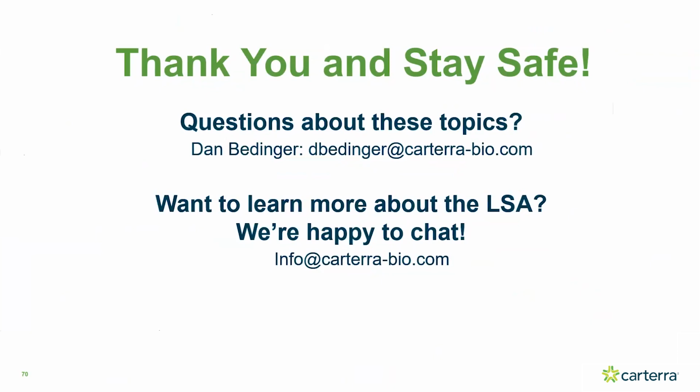And the other part of the question was, how do you ensure that you're capturing at the right density? So there's a few strategies. The best and the easiest is to immobilize at multiple densities. Then you can pick and choose. You would use probably the lowest density spot you have that has enough information to get a good kinetic fit, or maybe the lowest two if you have multiples.